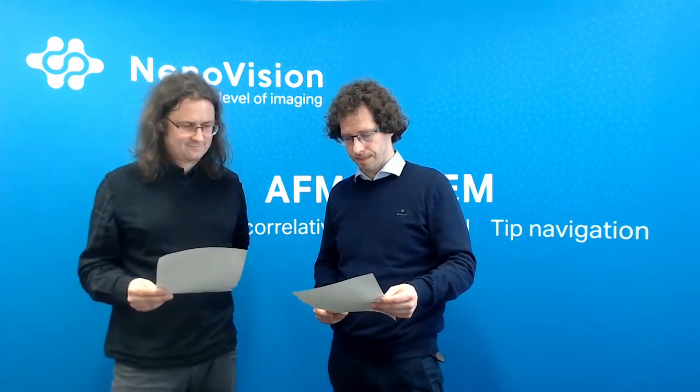A question: is the LiteScope suitable for all brands of SEM? I will try to answer. The LiteScope, you can install in almost any SEM of any brand, definitely. The only limitation to install LiteScope into your SEM is the size of the chamber. If it will physically not fit into the chamber because it's too small, then it's not compatible. Otherwise, we have special adapters for each manufacturer, and there is no problem. It's a very simple integration to most SEMs.